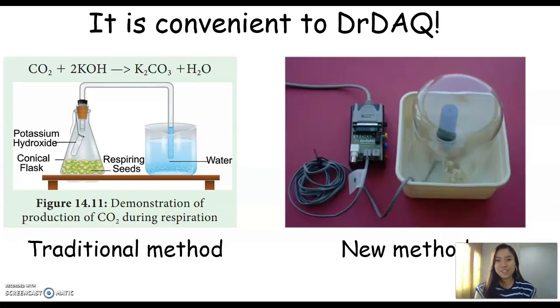Hello, my name is Easter Julian, and I'm going to continue the presentation. As my friend has presented earlier, it is very convenient to use the data logger, which is the DrDAQ data logger, which is used in this respiration experiment. It is very convenient because it gives accurate data and results, and it enables the data and results to be transferred directly to the computer to be analyzed directly.